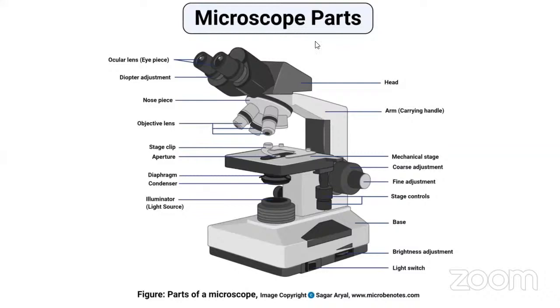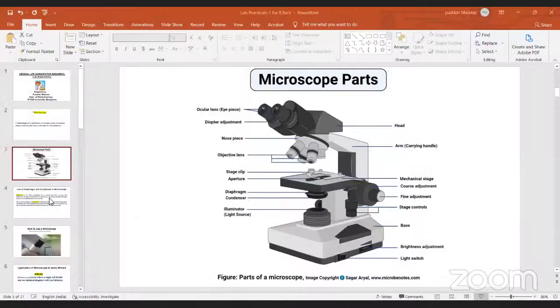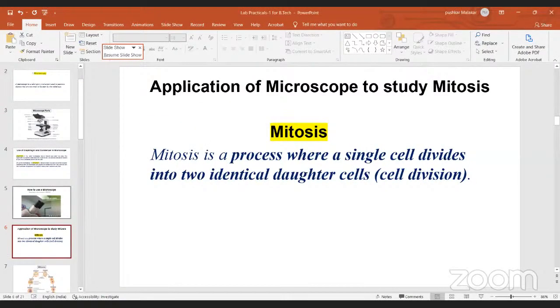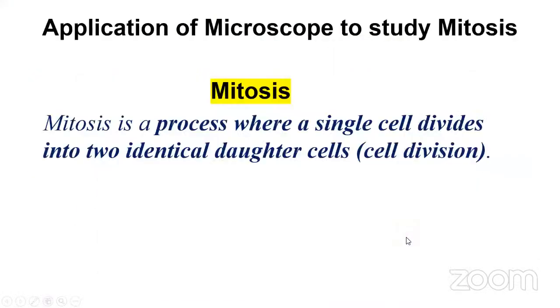Let's see once more. Now we will see how we can use the microscope to study mitosis.